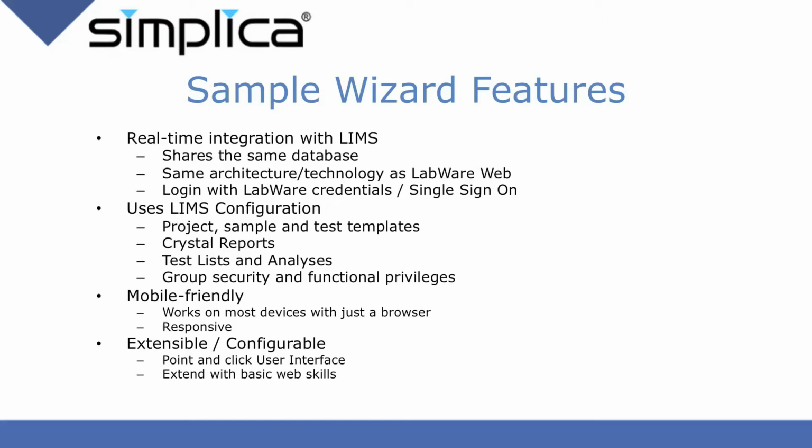The user interface for Sample Wizard is mobile friendly. It works with just a browser and responds to the width of the device to provide the best user experience. Finally, Sample Wizard is itself configurable. There is a point-and-click user interface for configuring its own user interface, as well as a way to extend the application with basic web technologies.